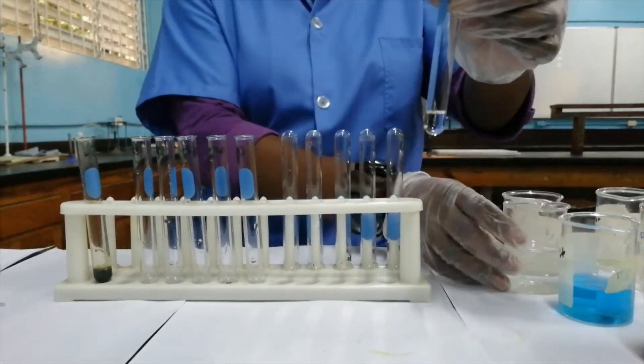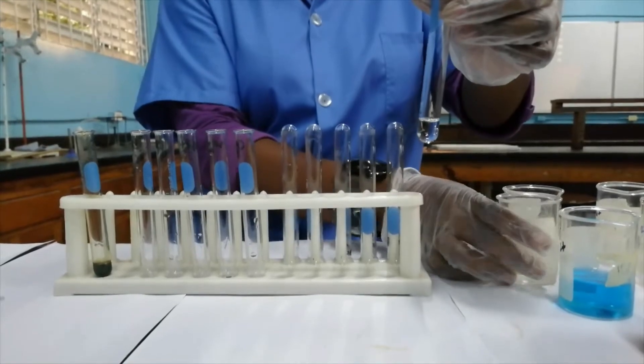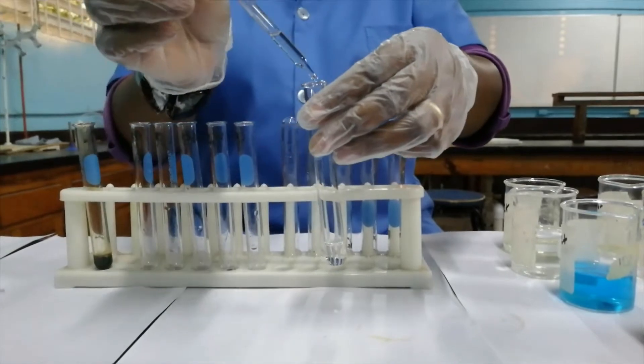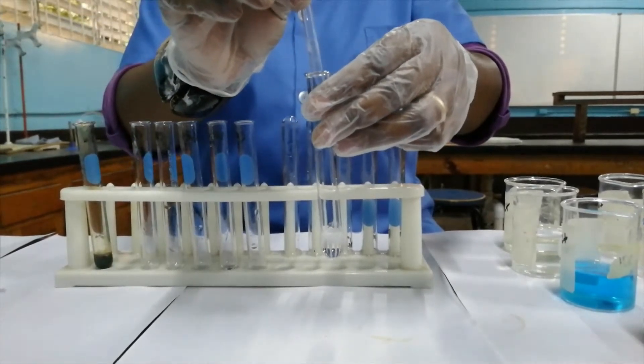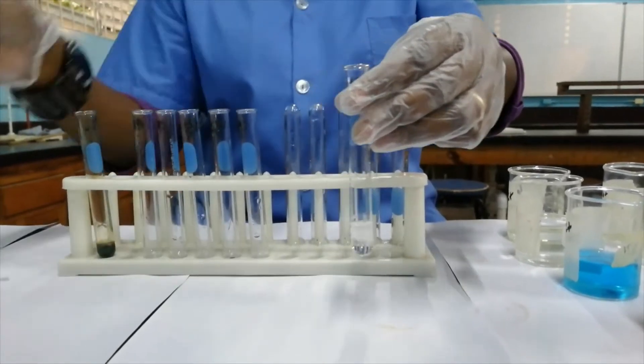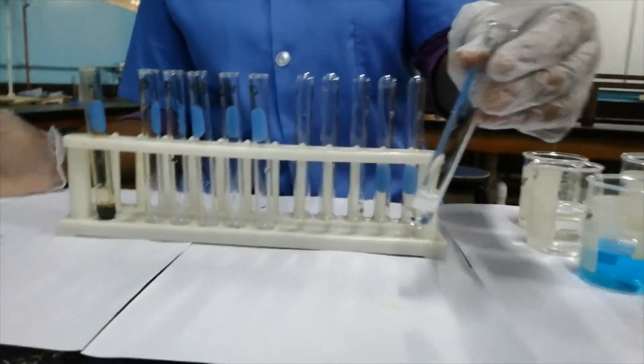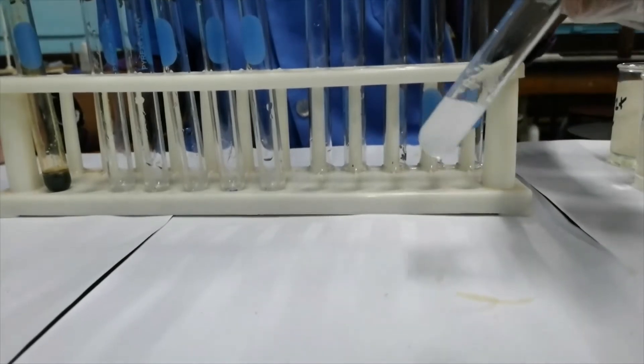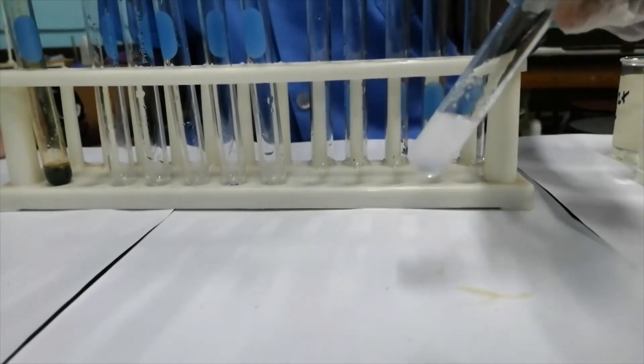This is now the aluminum ion that we're testing for — Al³⁺. We add sodium hydroxide to it and we have the formation of a white precipitate. Let me mix it thoroughly. So the white precipitate is there.